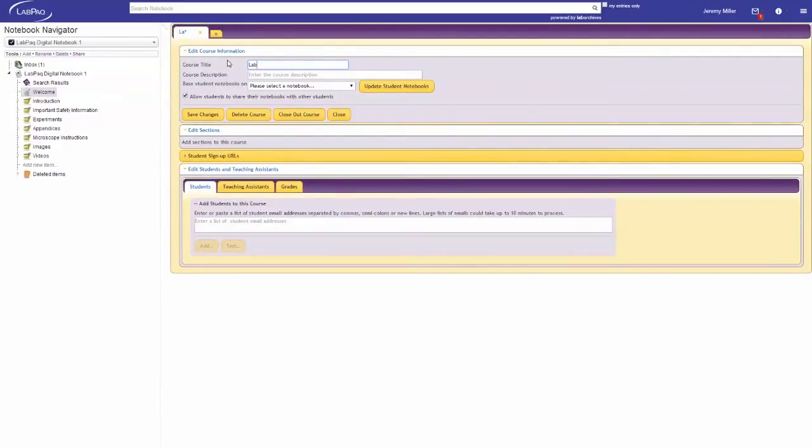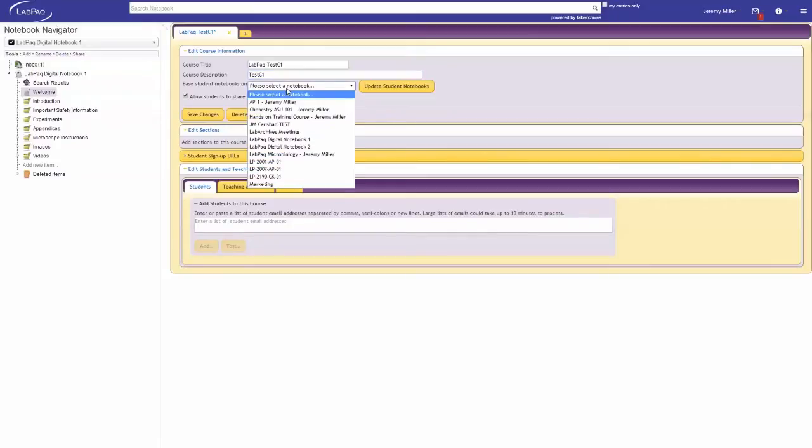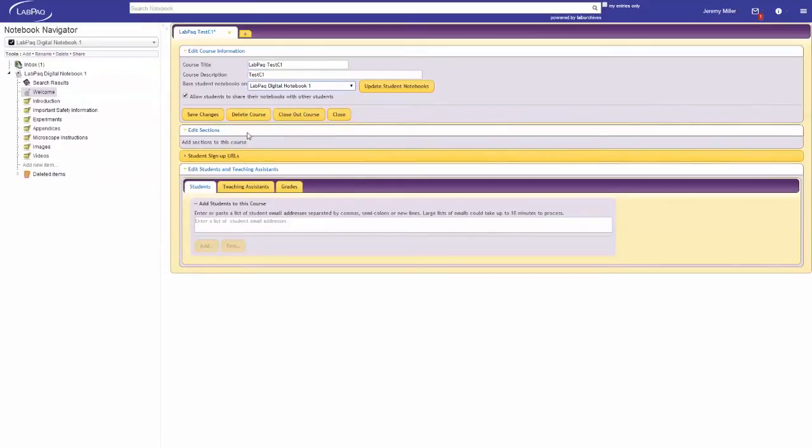Next you'll enter a course title and a course description. You may use the LMS course identification number or you can choose to use your master notebook or any notebook you have in your LabPack Digital Notebook account or simply select our default notebook. The notebook you choose is what each student will have access to.